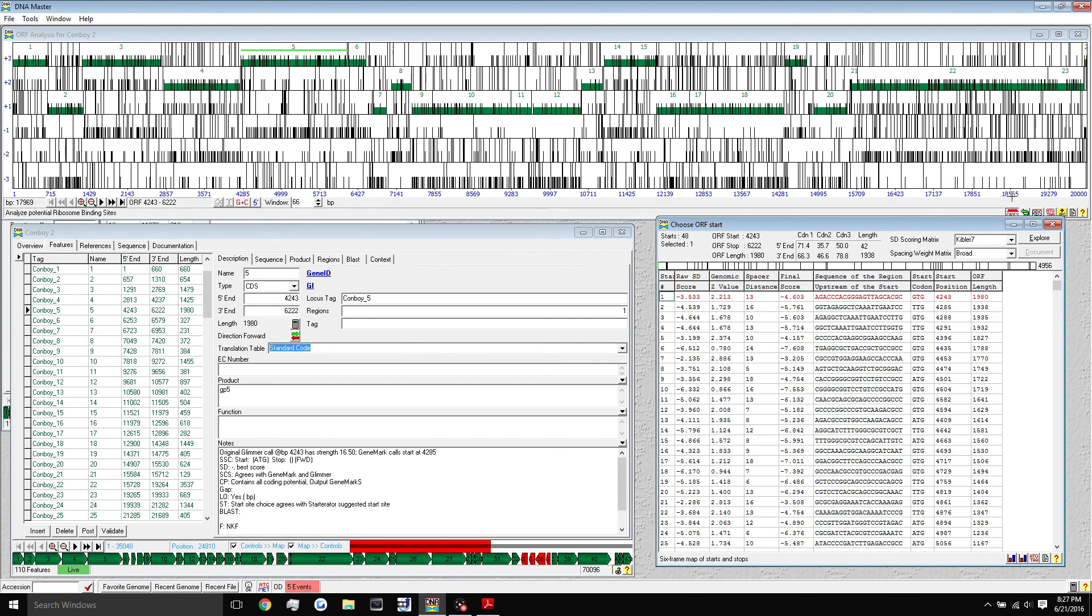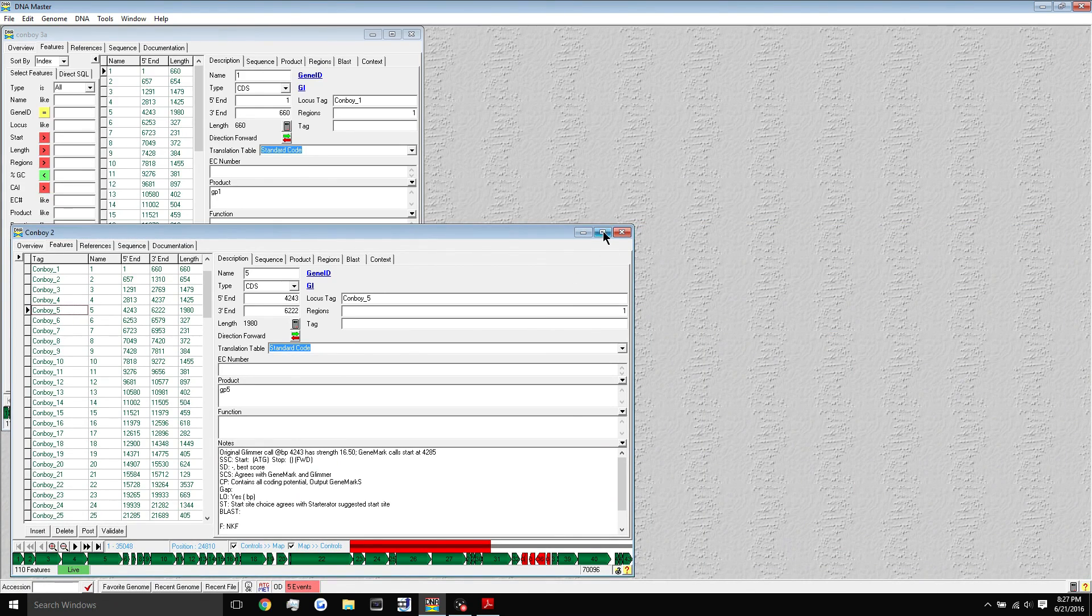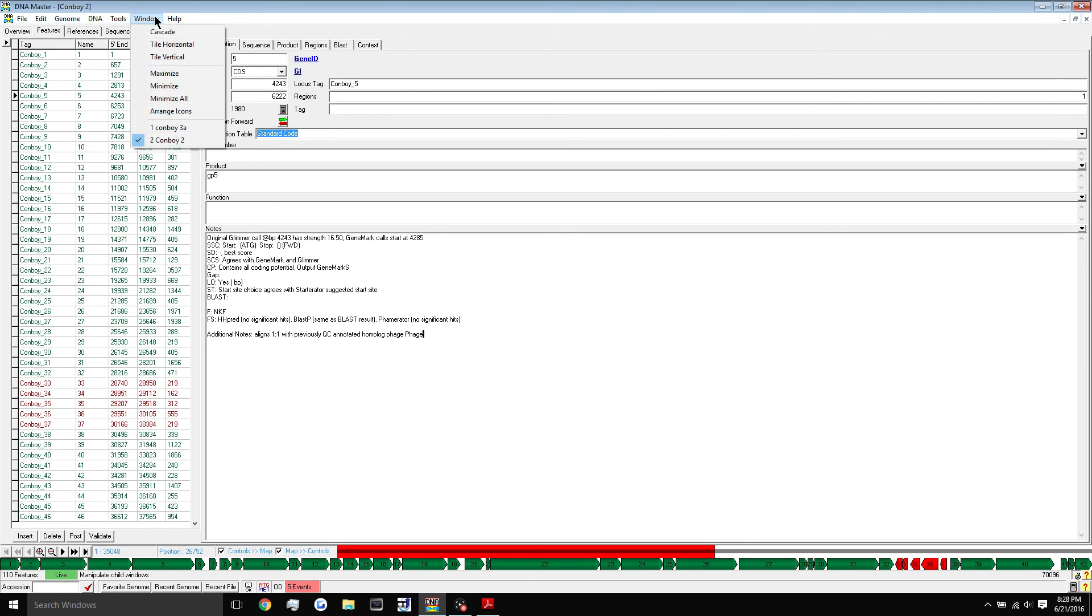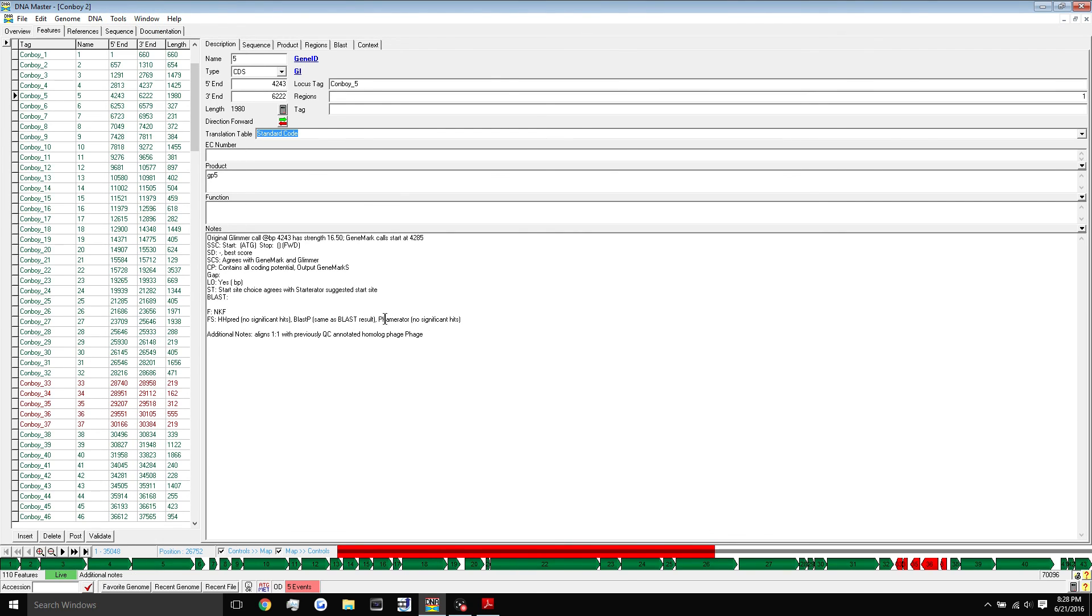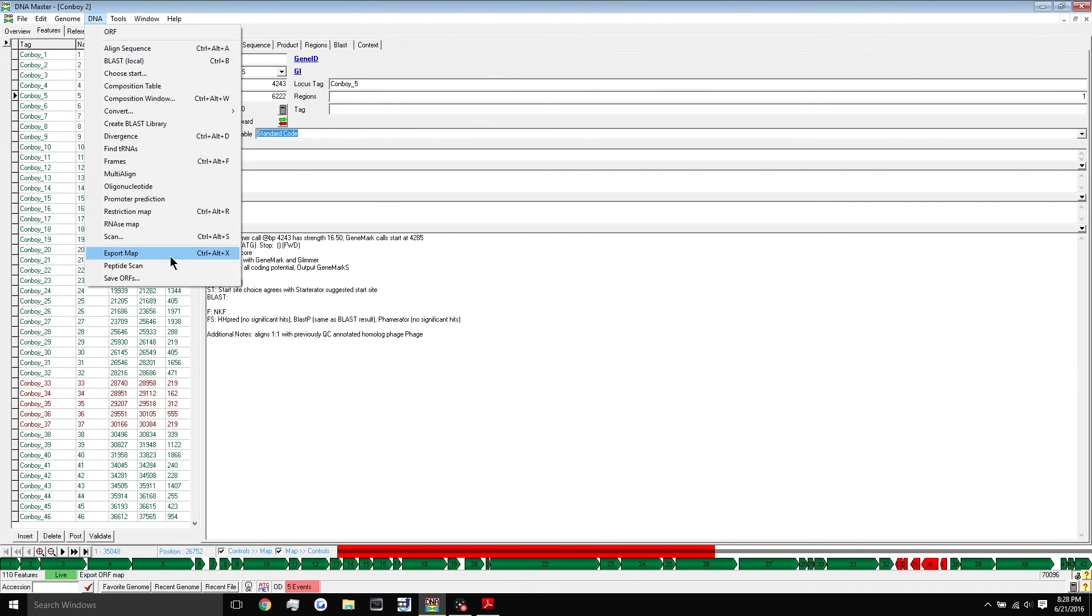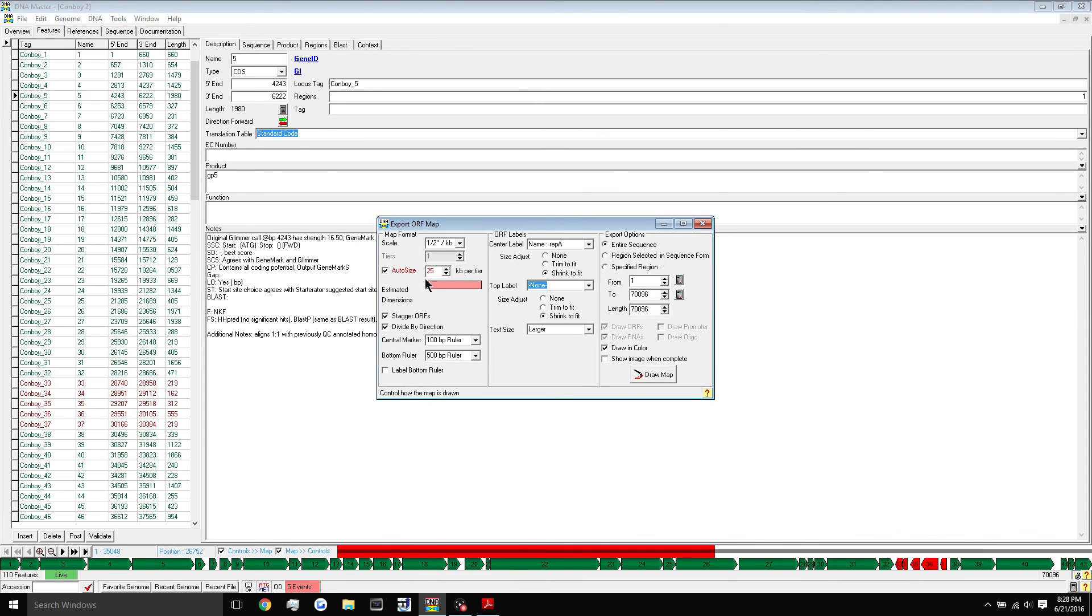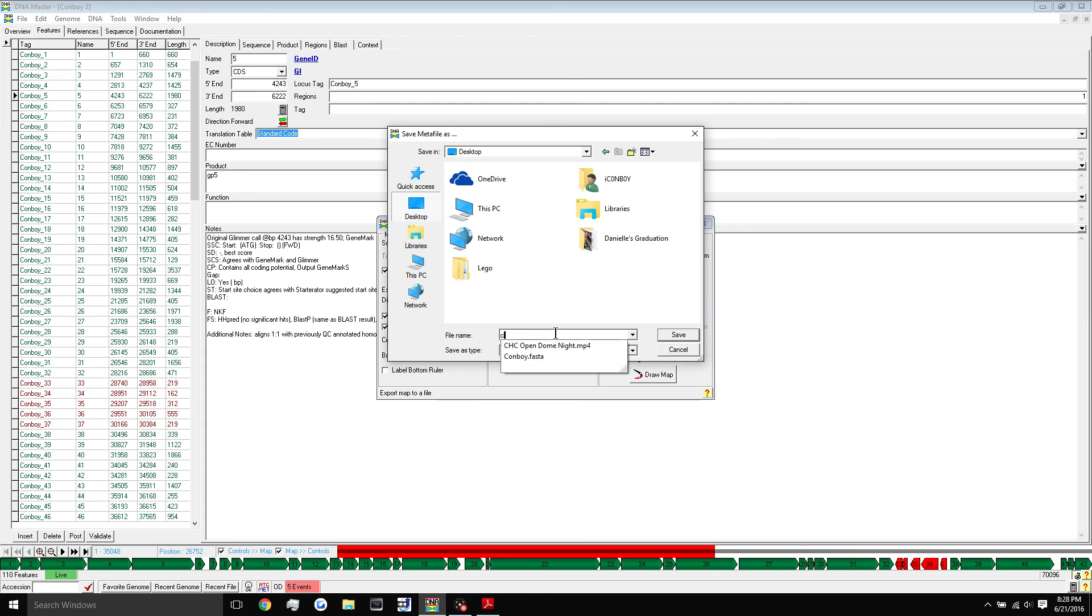So that was the frames. We can close out of that for now and open back up our main here. The last thing I want to show you guys for this tutorial is how to create a six frame translation map and how to export a map of your genome. To do that, we simply go up here to DNA and click export map. We can change some settings if you would like. You can save it by hitting draw map and we'll save it to our desktop. We'll call it convoy map.